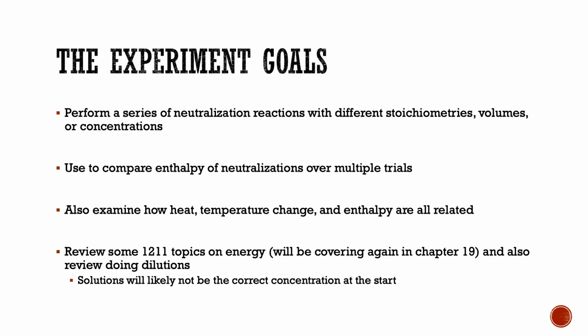And so if you have questions on that in the lab, please do ask your instructor, your TA, but do realize these are things you really should be comfortable being able to do going forward, because making solutions is a pretty general skill that anyone coming out of general chemistry really should possess.